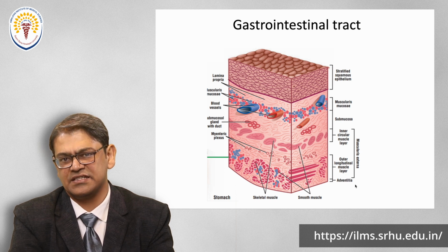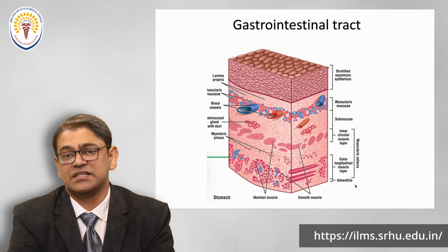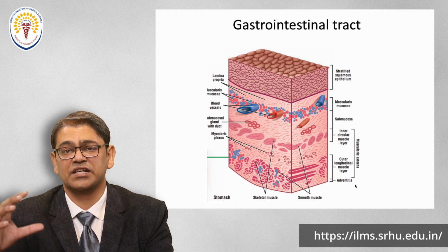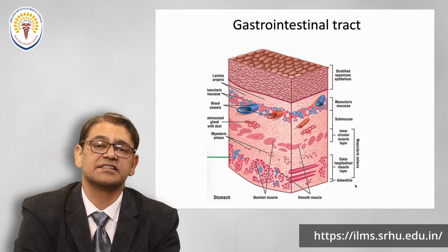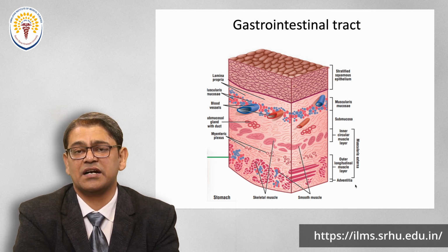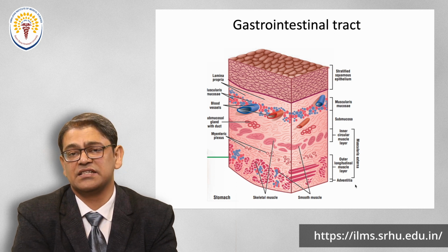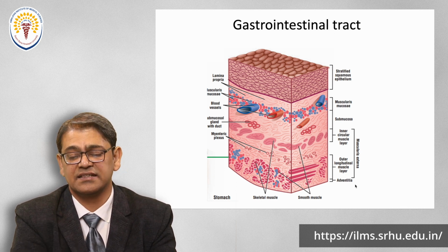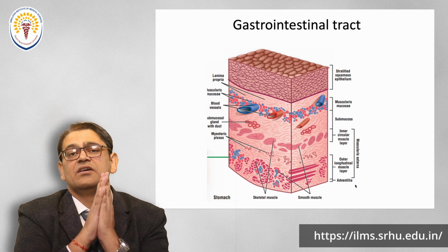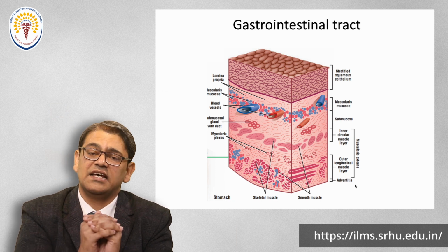For example, in the stomach and small intestine we see serosa. But if this layer is not present, we see patches of disorganized connective tissue, and that structure is named adventitia. So if you take the extraperitoneal side of the organ, we do not see this squamous layer, and it is named adventitia. So serosa or adventitia depends on which side of the organ you have taken for histological analysis.